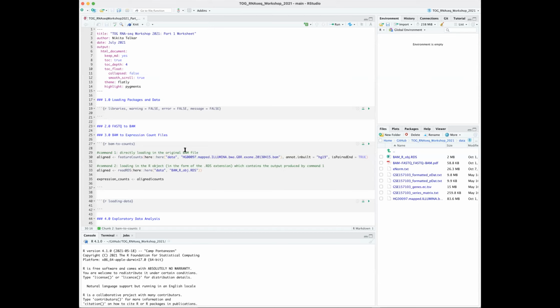Do you mind explaining quickly again? Maybe I missed that. How do you go from the FASTQ to BAM? It's not an hour, right? You showed something different. No, it's not. Okay, sure. I will go through that. Let me stop sharing.